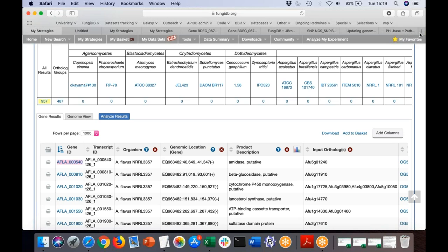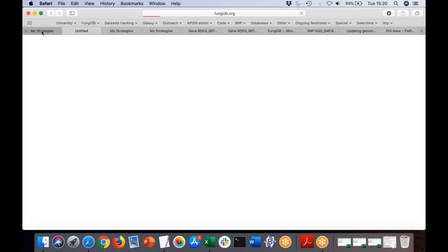I was trying to show a new RNA-seq summary page and gene record pages we have recently implemented. Normally when you look at gene expression across different datasets, it's nice to see how expression changes not only depending on the sample but the conditions used. Omar may show the gene record page in a few moments.